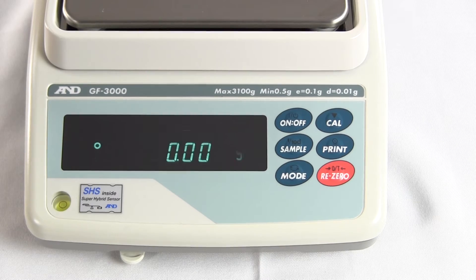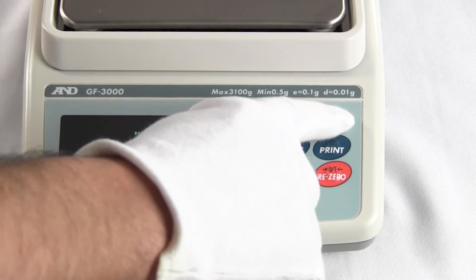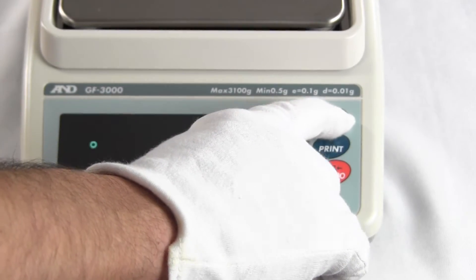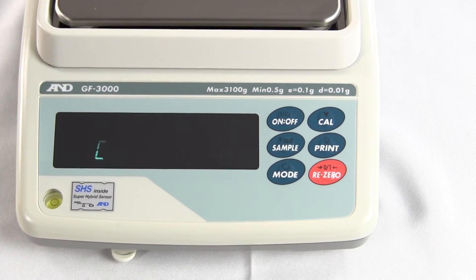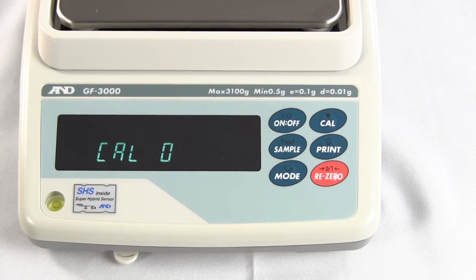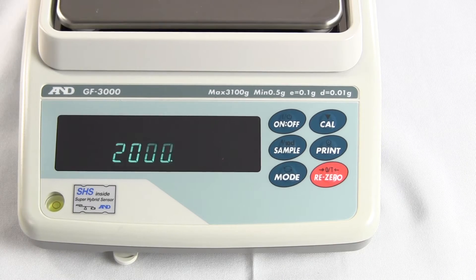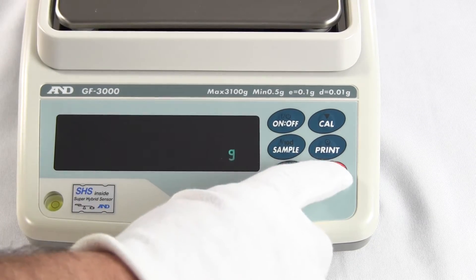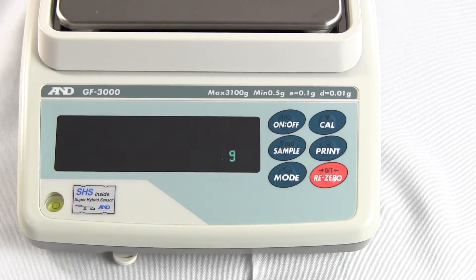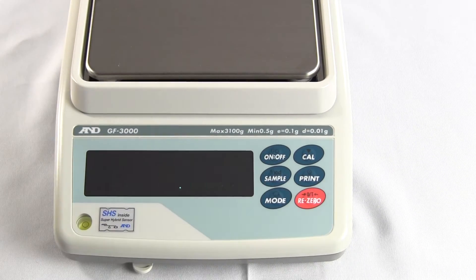We'll go through calibration so you can see this balance is right on the money. To enter calibration mode, simply press and hold the Cal button — you'll see Cal out, then Cal 0. On A&D balances you can select the calibration weight from manufacturer pre-configured options. When you see Cal 0, press the Sample key and the GF-3000 defaults to 2,000 grams. Press the ReZero key once to change to 3,000 grams, again for 1,000 grams, and again to return to 2,000. I have a 3-kilogram weight, so I'll press ReZero to select 3,000.